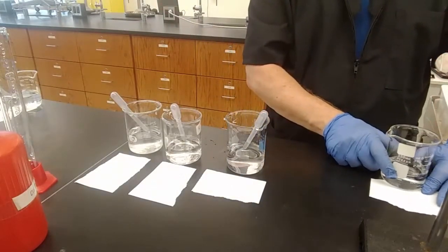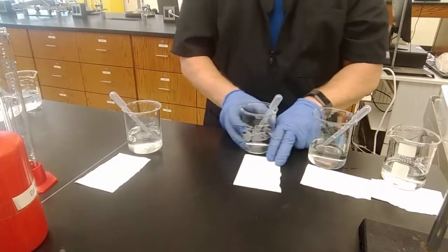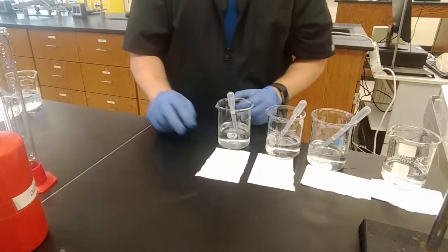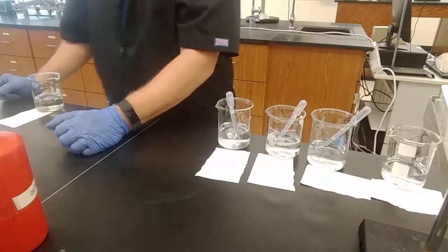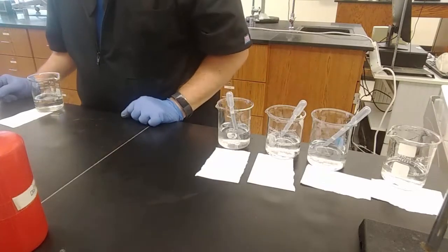pH 0, 1, 3, 4, and 14. Cool. All right, we're doing the same kind of serial dilution from the base this time, making lower pHs.